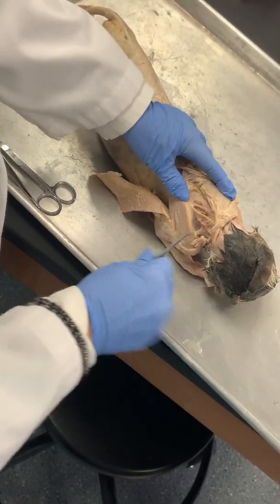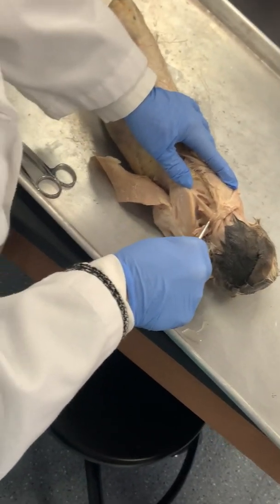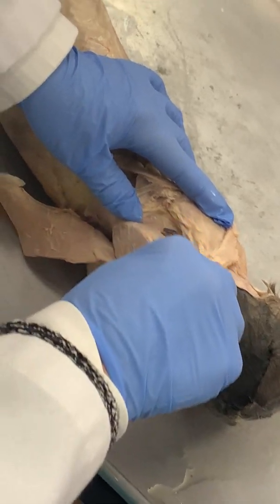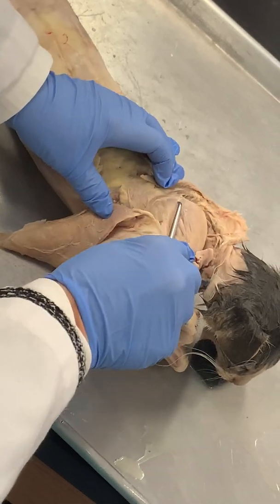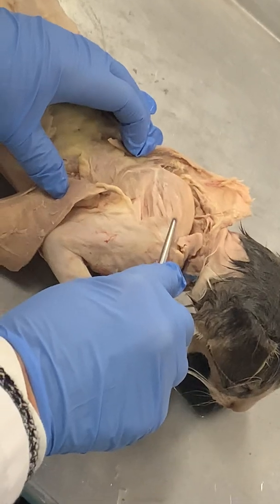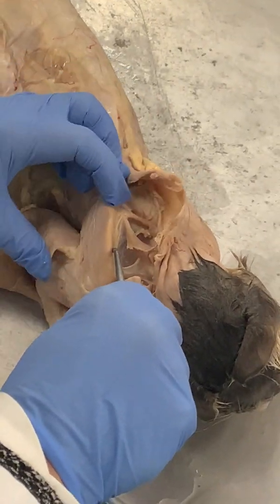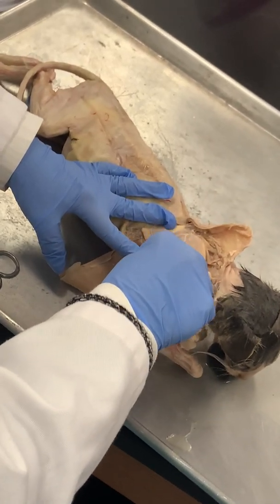The muscle going straight up here is the rhomboid capitis, unique to cats — helps to stabilize those scapula. This would be the rhomboid minor and this would all be rhomboid major. I can feel the spine of the scapula, I can see it there. So this muscle: supraspinatus, this one: infraspinatus, and if I pin in here: subscapularis.